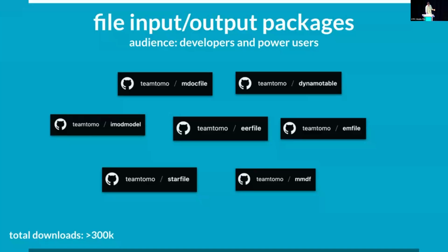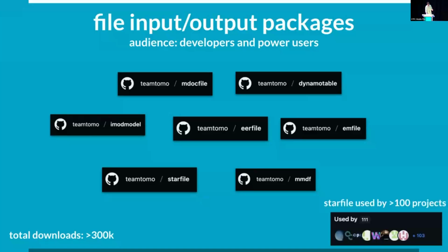It's a pain. And then, yeah, particularly, Relion has been hugely popular for a long time, and especially with tomography, people need to modify these star files a lot. And so that particular project has been used in over 100 people's GitHub repositories, and I'm sure countless other little scripts somewhere. So if that's been useful for you, thank you. And if it's not working for you for whatever reason, because it hasn't seen your data yet, do open issues and things.